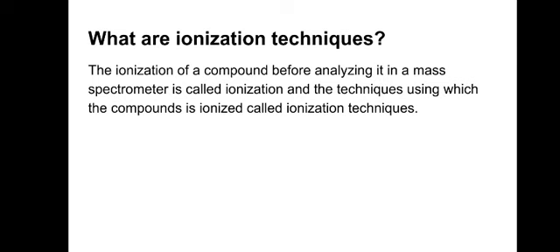This type of ionizing or breaking or fragmenting an analyte is called ionization techniques.